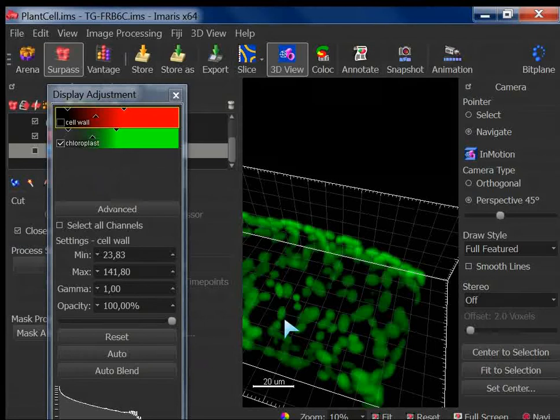Understood? Yeah. Now I don't have my original channel any longer. But if I want the original channel and also the applied mask, then you have to say, okay, please duplicate it. I mean, retain the original one, apply the mask on that, and also create a channel with a mask. So one is with mask and one without mask. If you want both with mask and without mask, then check it.